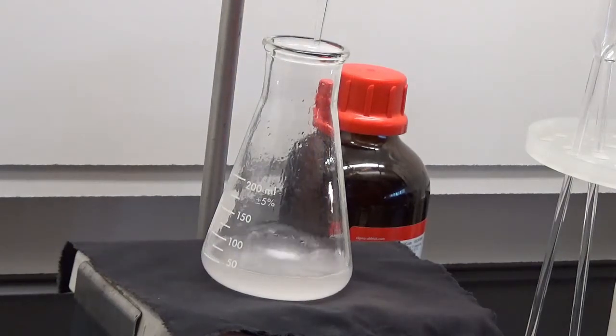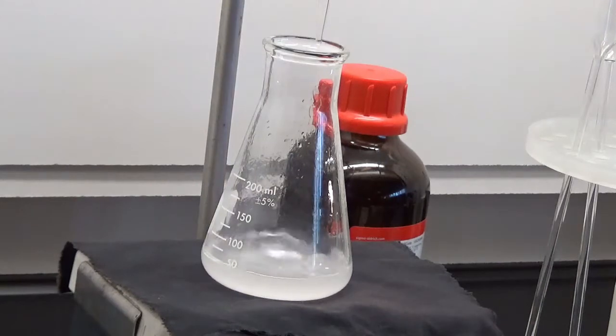So we just add some drops. All right, that was 10 drops. Let it mix a little.